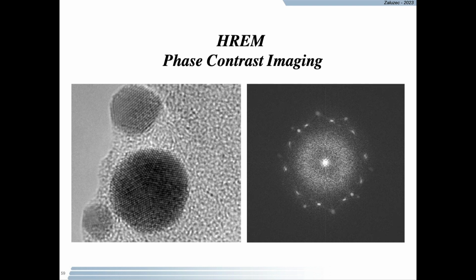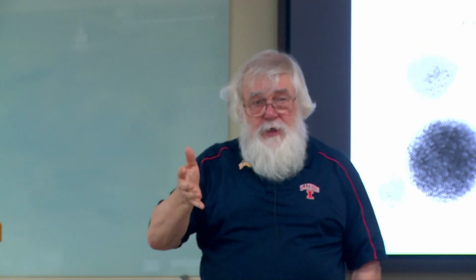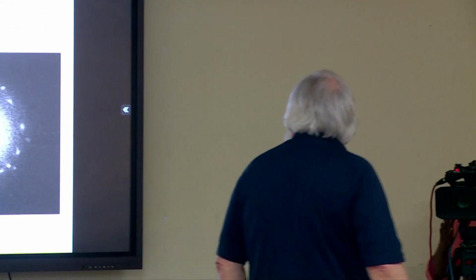What I'd like to go over for a few minutes is how to look at phase contrast or high resolution images. Everybody says, oh, I just want a high resolution, atomic resolution image, and they really don't think too much about it. So Hamish is going to talk about diffraction contrast and defects. I'm going to spend a little bit more time here on phase contrast.